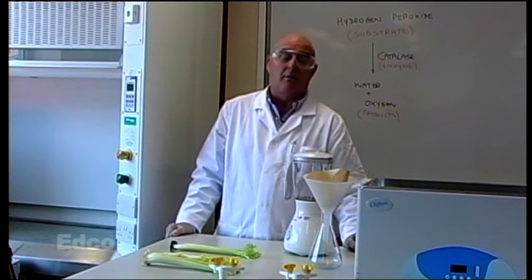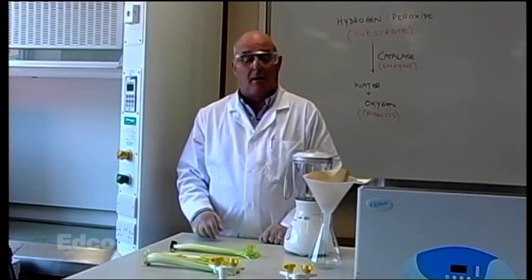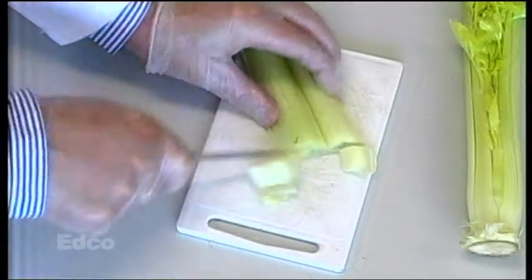Living things produce a very nasty chemical called hydrogen peroxide. To break down hydrogen peroxide, the living things have catalase. So catalase is the enzyme we're going to use. We'll use some celery, and to get us some enzyme, we'll chop up the celery.